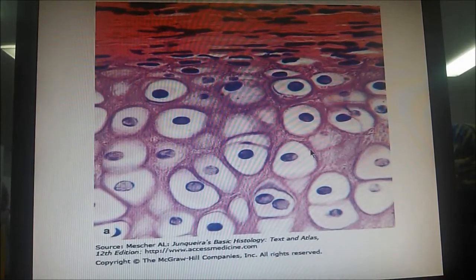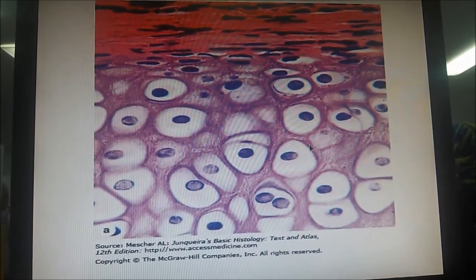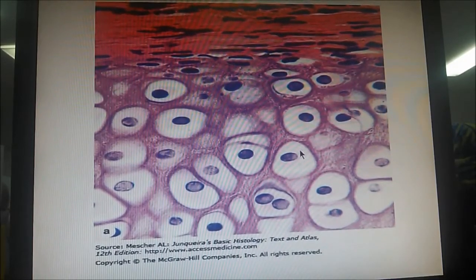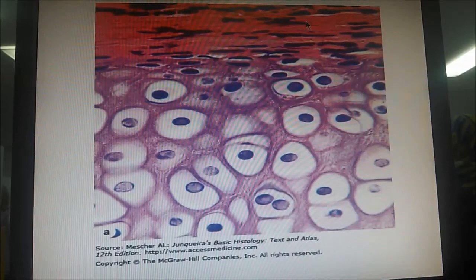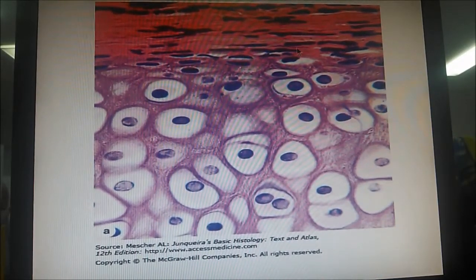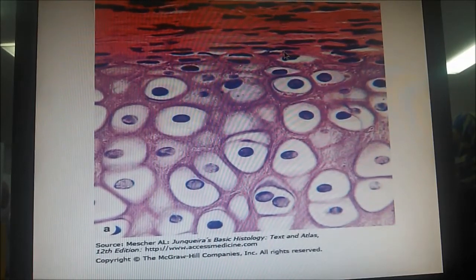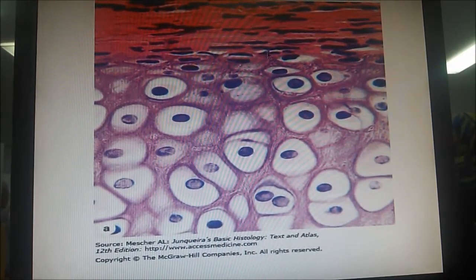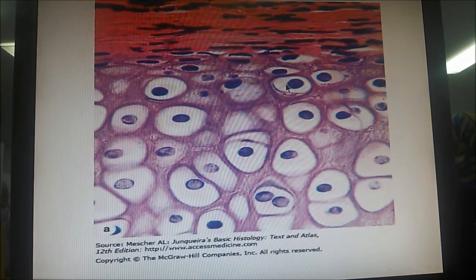بس بالتيريتوريال ماتريكس large amount of ground substance والground substance basophilic، فthis is why it appears darker. هذا اللي فوق شو حكينا اسمه؟ connective tissue اللي برا، perichondrium. الانر لاير منه اللي دايركتلي فوق الكارتلج الفلاتند سيلز هدول هم الستيم سيلز تبعون الكارتلج، اسمهم chondrogenic cells. They differentiate into chondroblasts لما يكبر شوي والchondroblasts differentiate into chondrocytes.